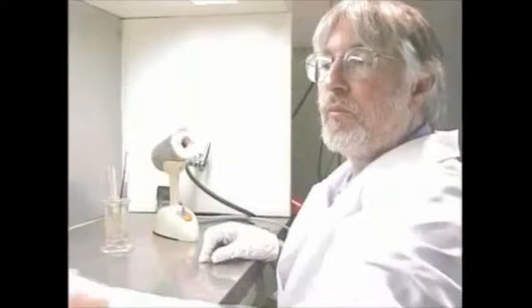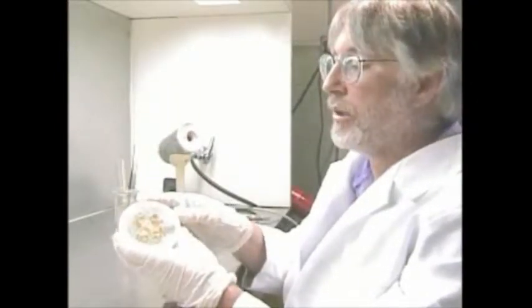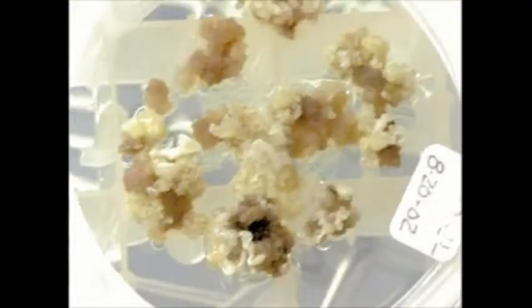The next micropropagation technique I'd like to talk about is somatic embryogenesis. This is regeneration through induction of asexual embryos. We talked about how it occurs naturally on the margins of leaves and in the case of clonal seeds called apomixis. In this case, we're using a sterile micropropagation system, and this happens to be a cluster of callus and somatic embryos of American ginseng, Panax quinquefolium. We're very much interested in this plant in our research program.